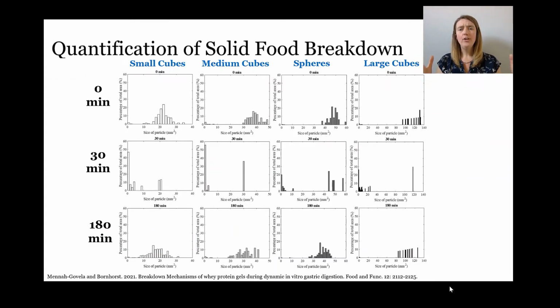So if we take a look at all of our treatments together, in the rows we start with before digestion, 30 minutes of digestion, and 3 hours of digestion. And in our columns, we see our small and medium cubes, spheres, and our large cubes.